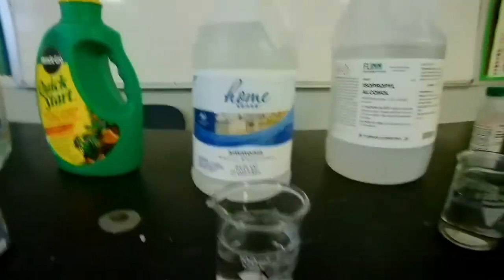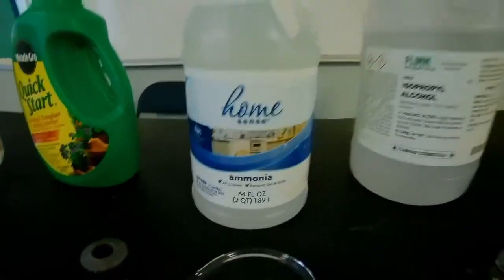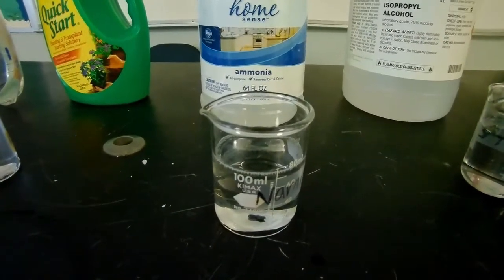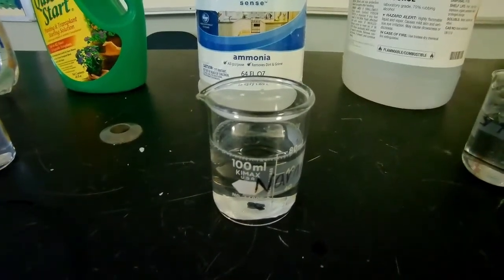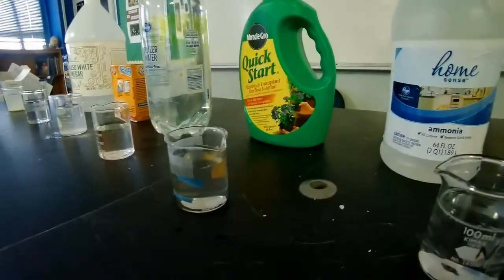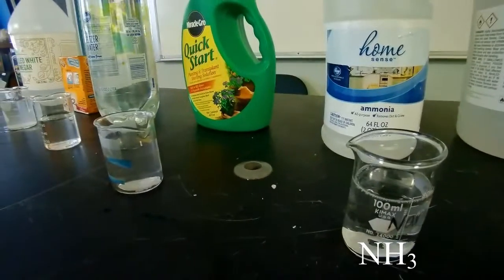All right, our next contender, chemical number 6, is ammonia. And ammonia is a household cleaner. I can tell you right now, I don't even have to do a smell test. I can smell it from here. It's burning my nostrils. I'm not putting my nose anywhere near it. It's very intense smelling. I wouldn't say it's sour or anything else. It's just really intense. And you might notice ammonia I just mentioned when I was talking about fertilizer. So yes, the chemical ammonia, NH3, is found in fertilizer.